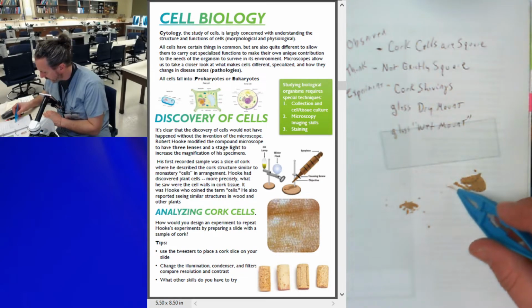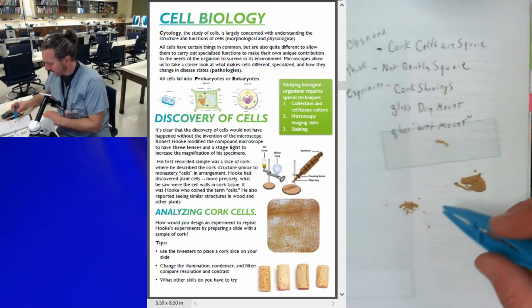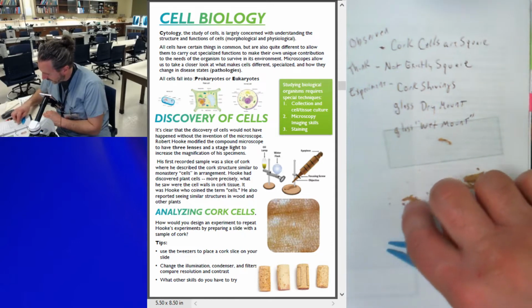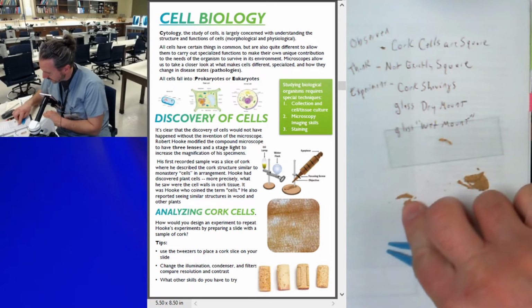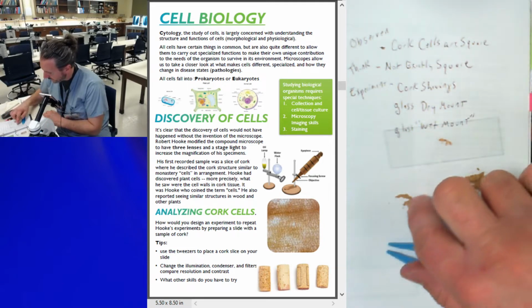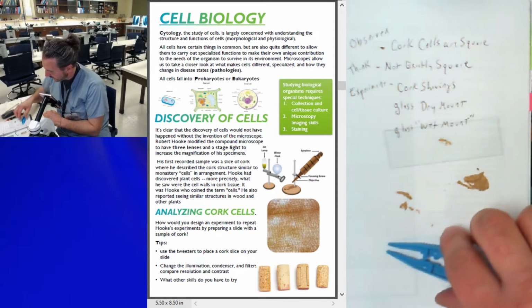I mean, I can see paper right through it. I'm thinking that's going to be perfect. But I'm going to take my finger and kind of brush some of these loose pieces together. Press my finger on it and just sprinkle them. My finger's a little dry.